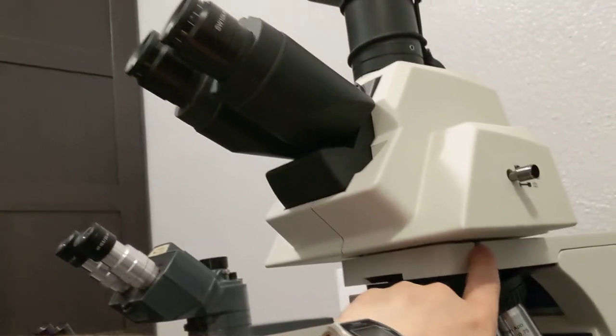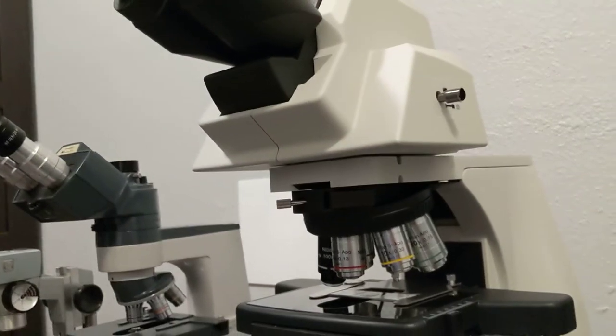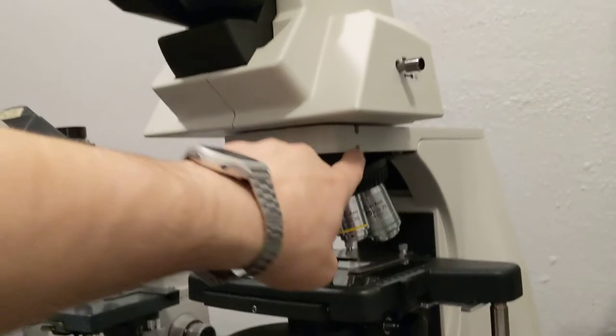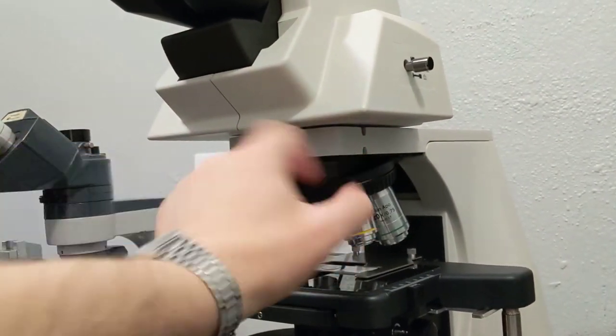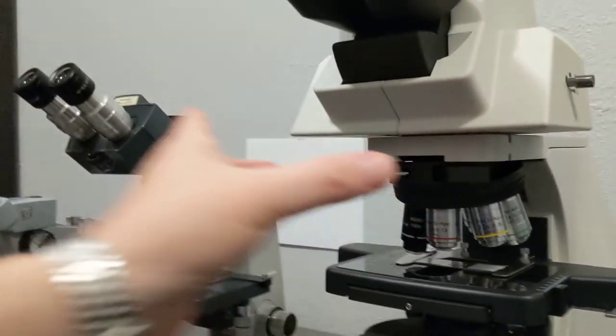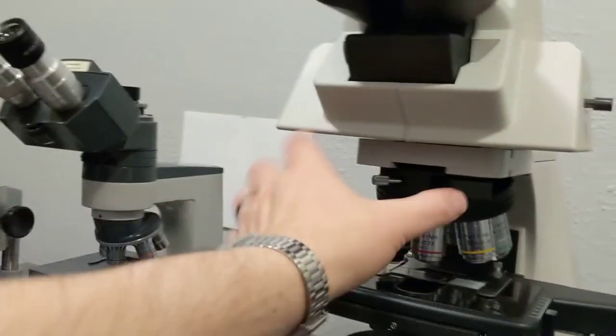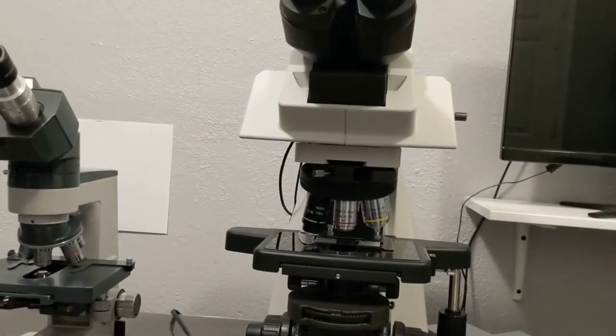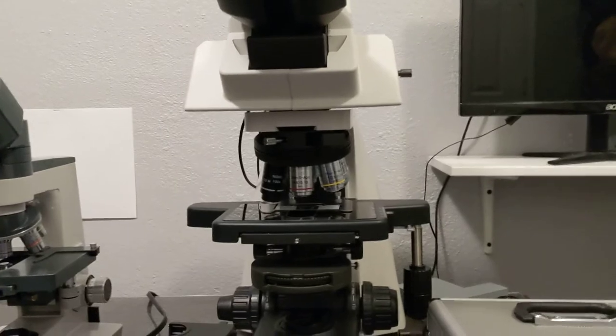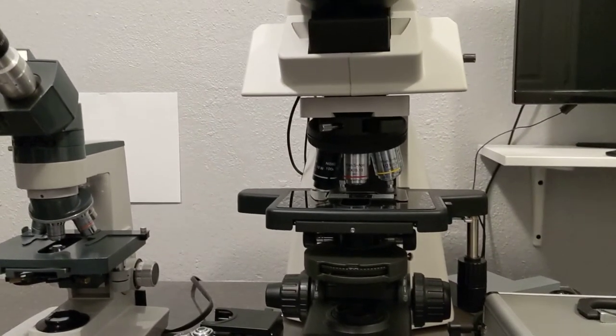The head screws on with just an Allen screw. There's an Allen key on the back. If you undo that, you can remove the nose piece completely. It slides out on a little dovetail. It's easily interchangeable, maybe just a little bit harder to interchange than the condenser itself.